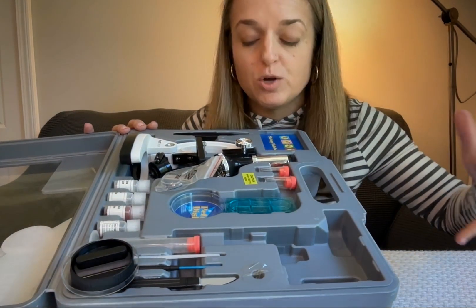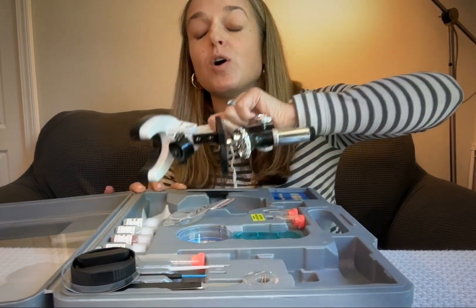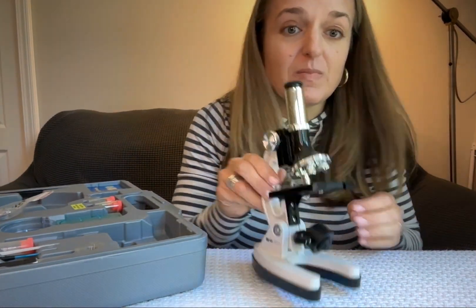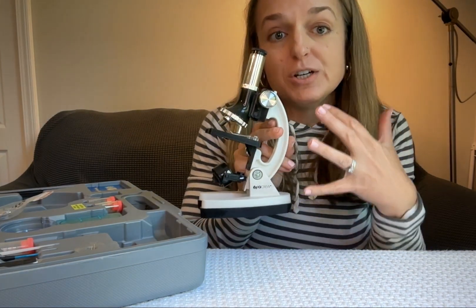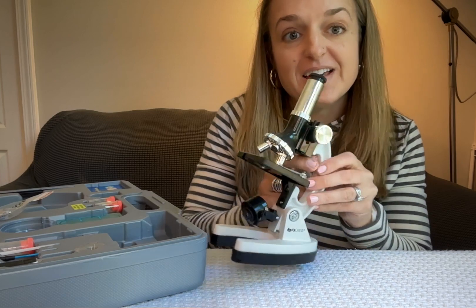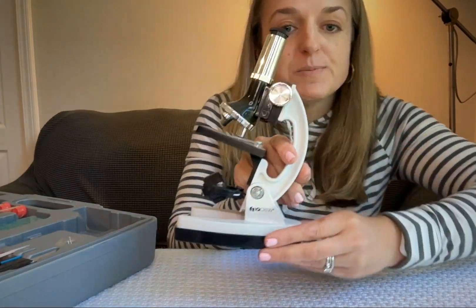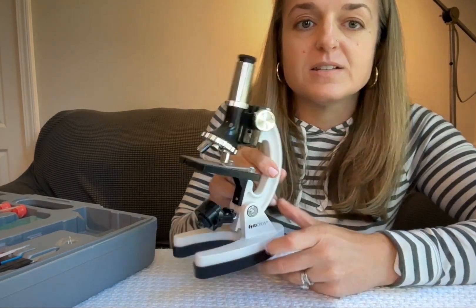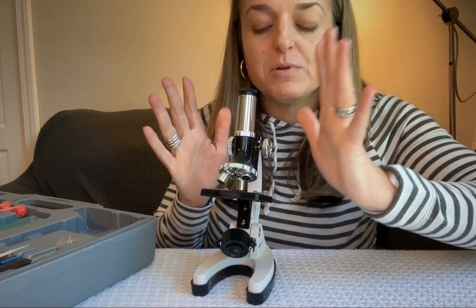So there's just basically everything you could want for a microscope set right here in this kit. This is the microscope itself — it's a great one for kids. It's on the smaller side but it looks very realistic, like the kind used in a real lab or at least in high school labs. That's pretty cool because kids are going to get used to what these look like.